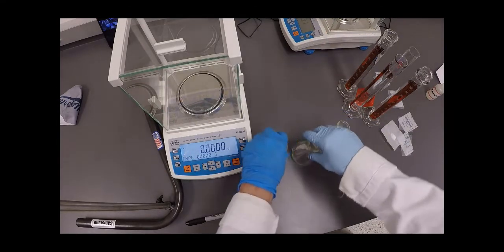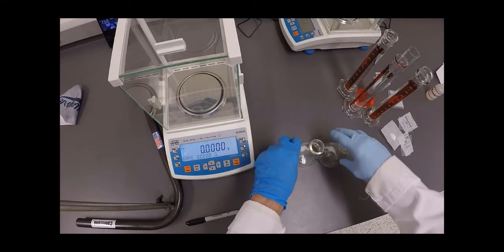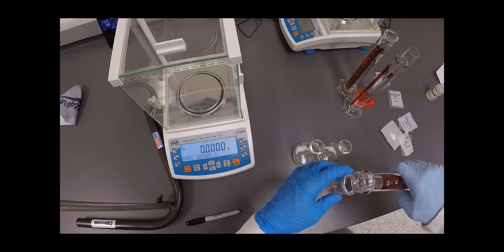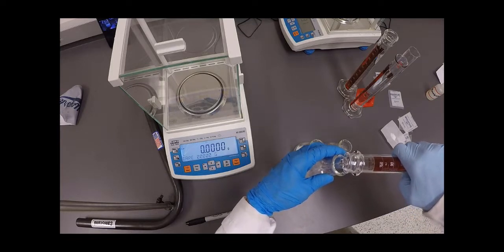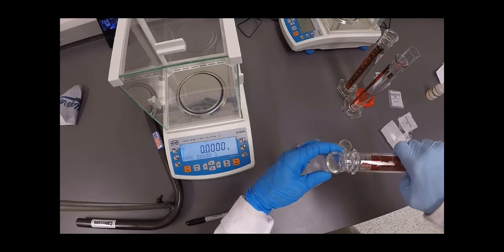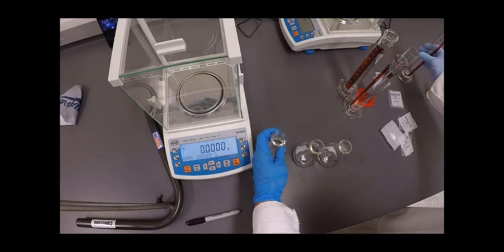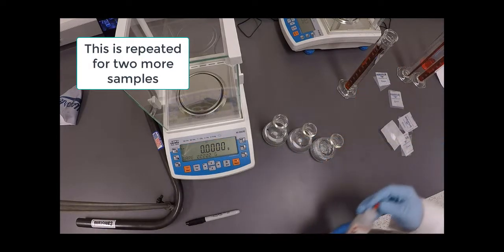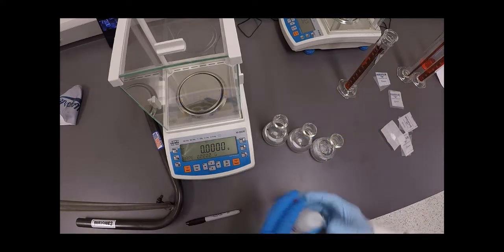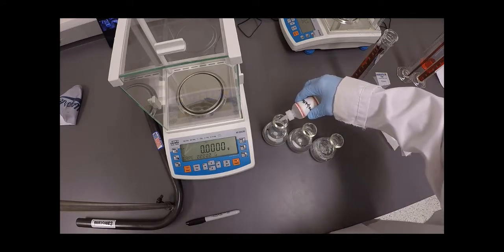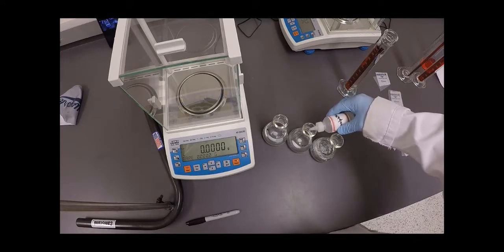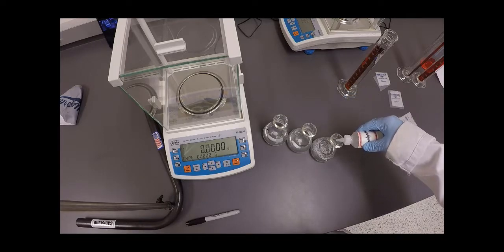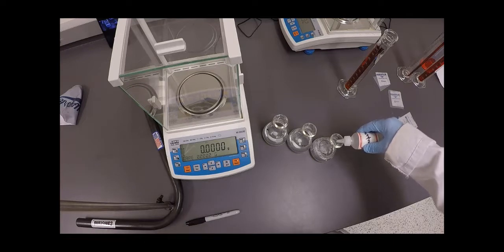Now to each of these three Erlenmeyers, I am going to add 100 milliliters, about, of water. Finally, I'm going to add two drops of phenolphthalein to each flask. And this is the indicator. So once this stuff becomes basic, it'll turn pink.